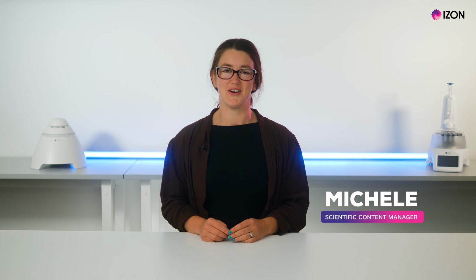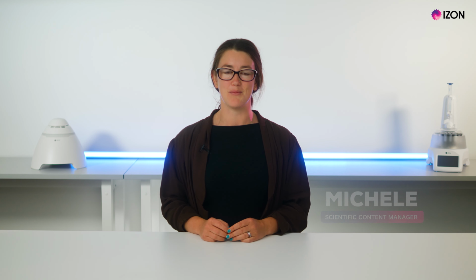Hi, my name is Michele Trott, and in this video I will be sharing some considerations for the storage of EV samples derived from milk, urine and cell culture media.